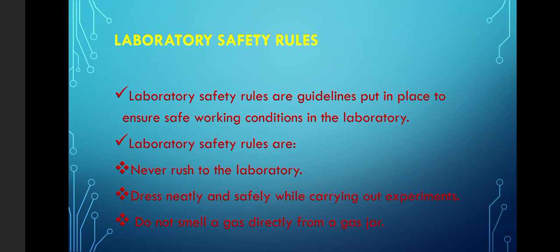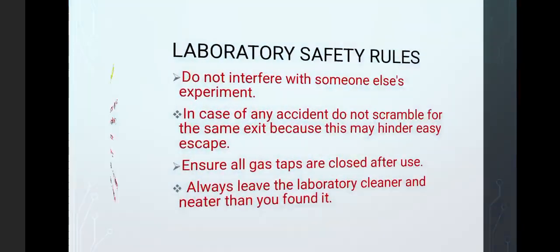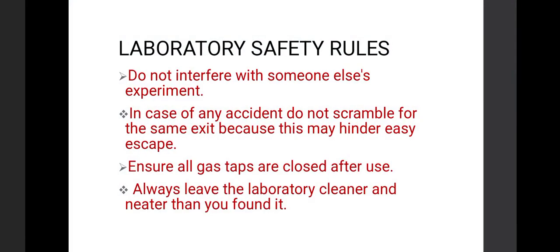Number 3, when you are operating in the lab, you are not supposed to smell a gas directly from a gas jar. When you want to smell a gas from the gas jar, you are only required to waft the gas into your nose and not to smell it directly. Another rule that you must observe when operating in the lab is that you should not interfere with someone else's experiment.